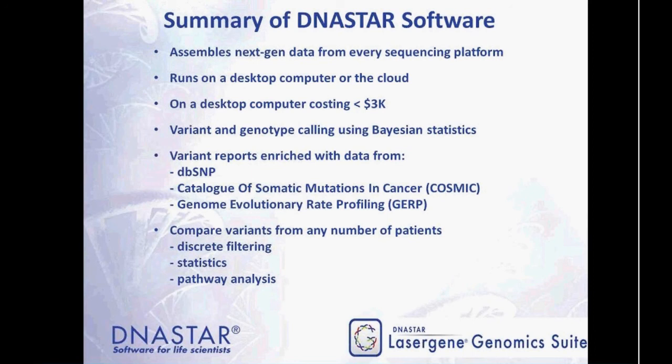And so VCF files for human data sets are usually from the Exome Variant Server at WashU, but there's also the 1000 Genomes Project for humans. The other VCF files could be produced just about anywhere, by any other kind of analysis software. So if you're working on a non-model organism and you have some VCF files, what you do is you bring them into ArrayStar, and ArrayStar will recognize that there are columns of information, and hopefully it'll just read the VCF file directly, but you can also use that custom import wizard to define what the different columns of information are to bring the data into the project.